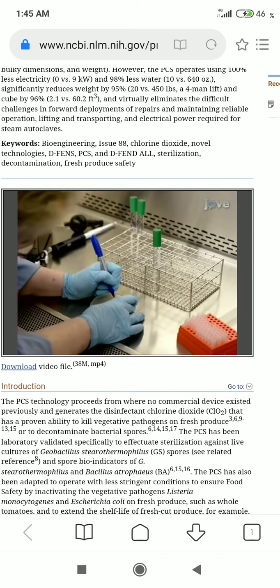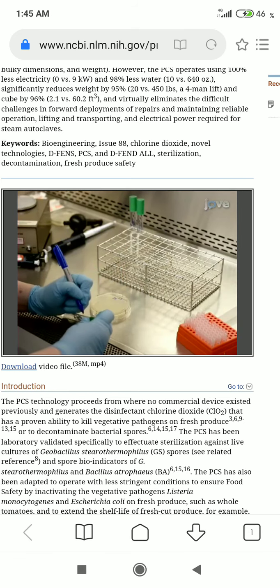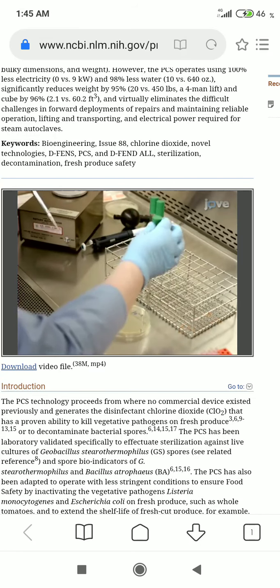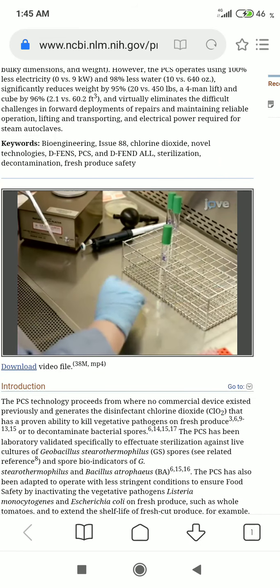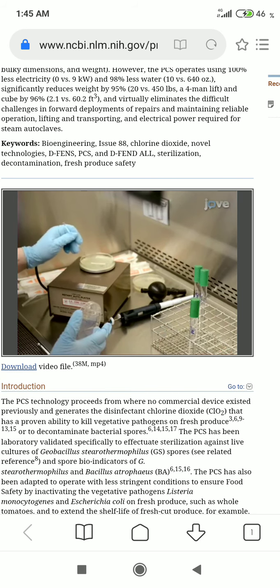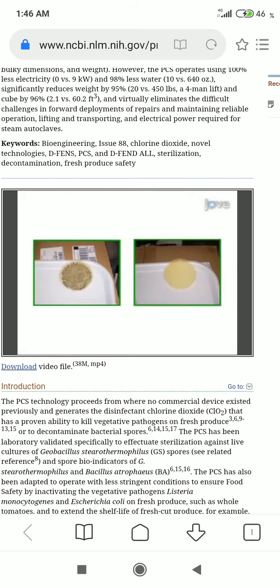For validation of Defend on porous surfaces, prepare petri dishes of Baird-Parker agar containing egg yolk tellurite and yeast extract. Inoculate the agar surface to 10 to the 5th with a 3-strain cocktail of Staphylococcus aureus and spread the inoculum uniformly over the agar surface using a glass hockey stick. S. aureus growth on this medium is observable as distinctive black colonies that don't show up when cells are killed.